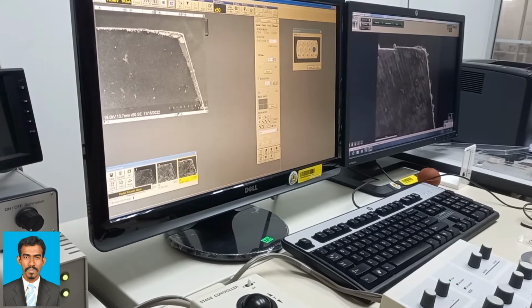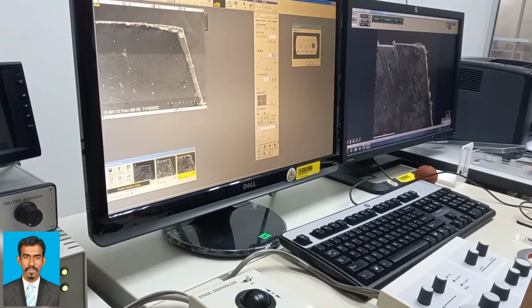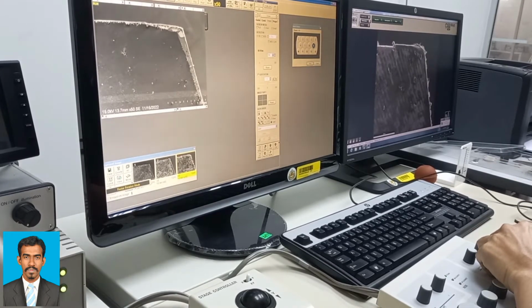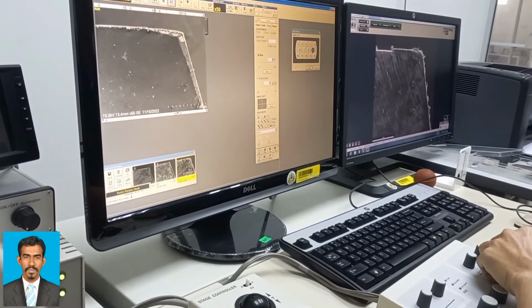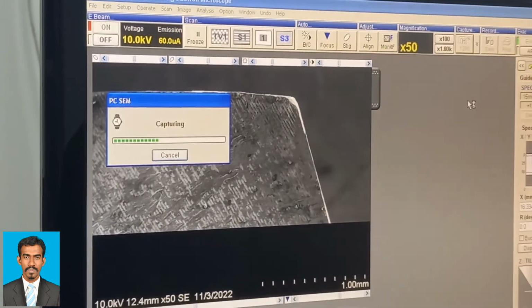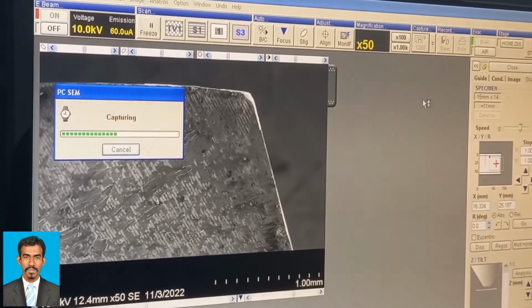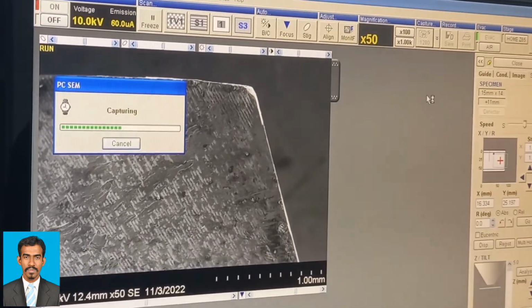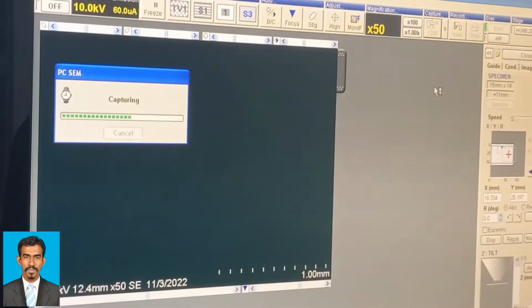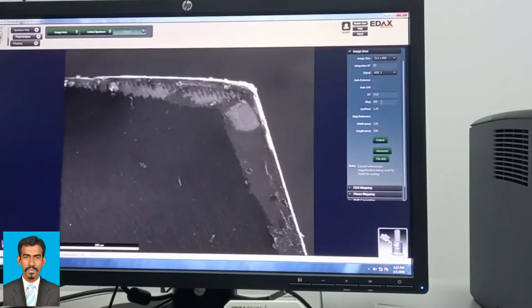Adjust the focus, magnification, contrast, brightness, etc. until you get a clear image on the screen. You can also vary the scanning speed to scan. Once you obtain a clear image on the screen, click the Run Freeze button. So the scanning image will be frozen and image capturing will take place. This capturing process stores images using the specified scanning mode and specified resolution. Then you can save the image. This would be displayed at the bottom.